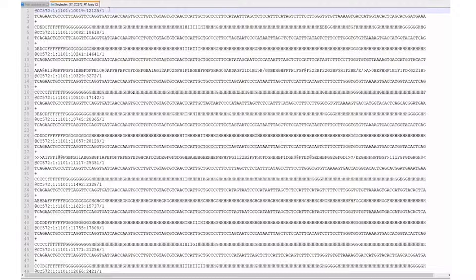This information contains the read name, sequence, and associated quality scores of each read in the sample you sequenced.